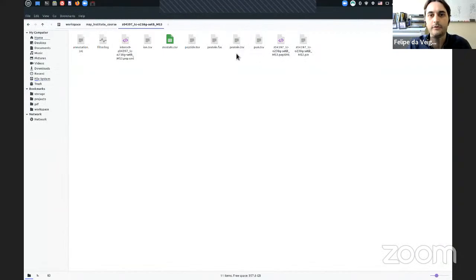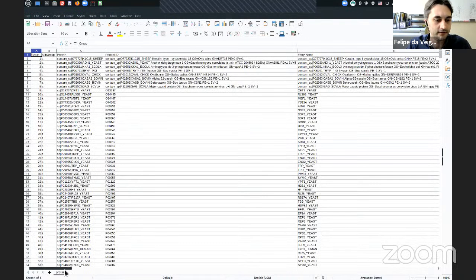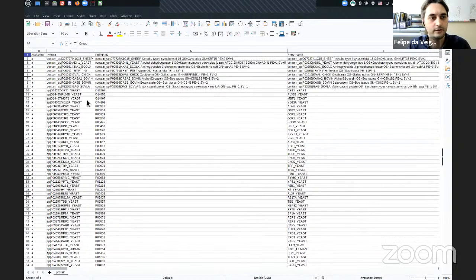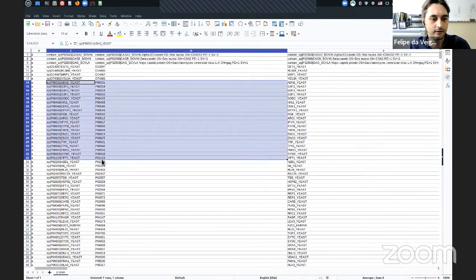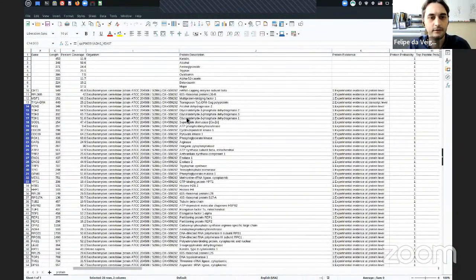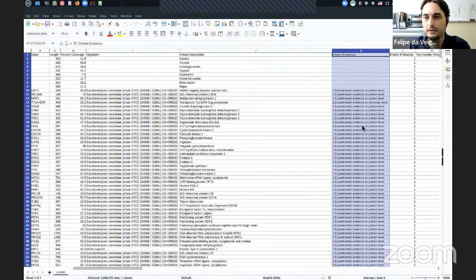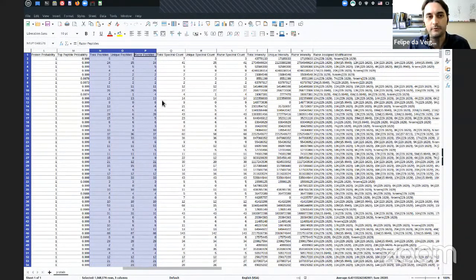And the other table here is the protein table. So this is basically the information on all the identified proteins. Here, for example, you can see some of the contaminants with their identifiers. These are all target proteins. So, the basic information about them. If you're using data from UniProt, for example, you can see their evidence level from HUPO, their description, and here some quant data. We tell how many peptides map to those proteins.